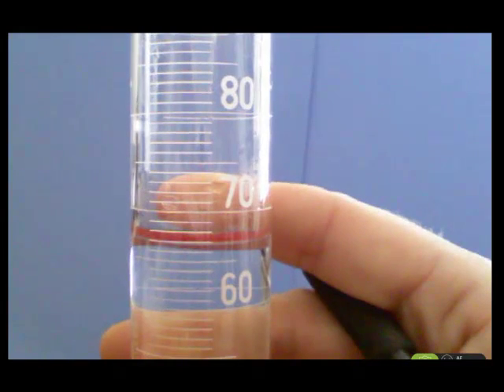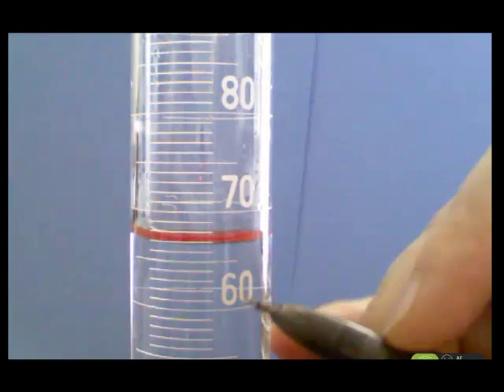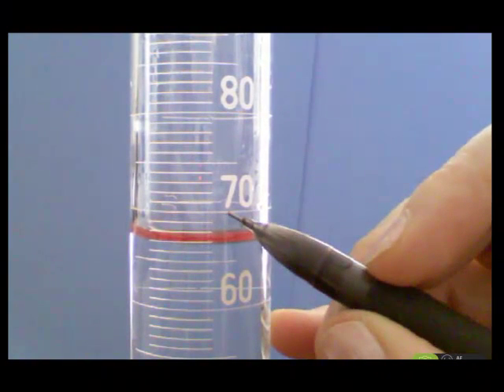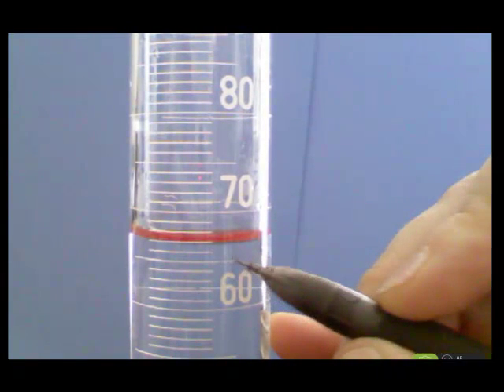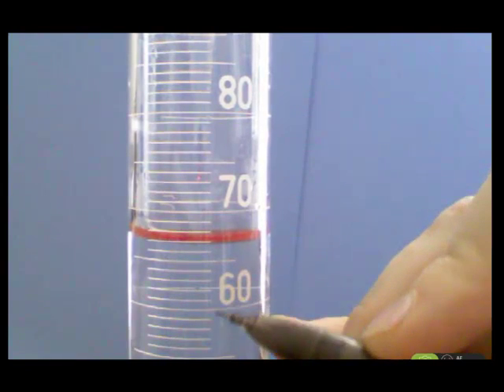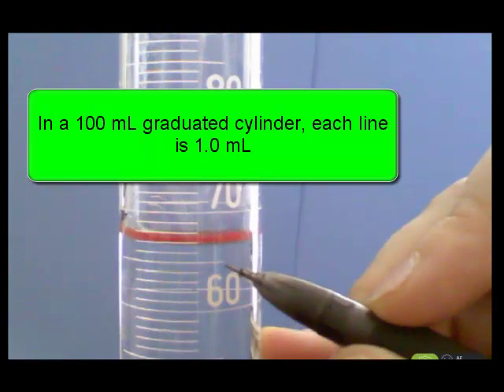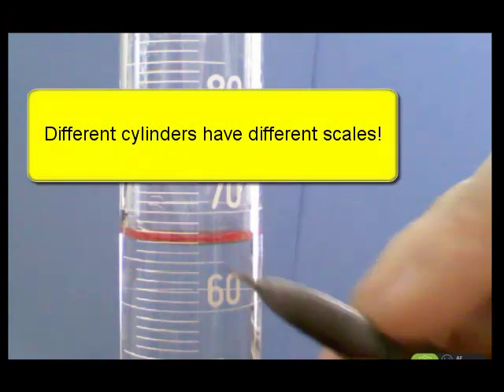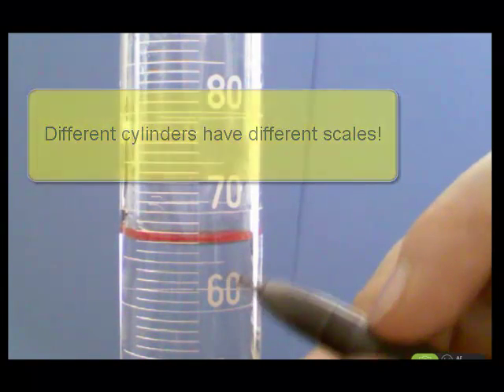Now let's look at the scale. This is a 100 milliliter graduated cylinder. This line here is 60. This line here would be 70 milliliters. So halfway in between, this big line here would be 65 milliliters. So each line is 1 milliliter. Every time you use a graduated cylinder, you need to look at the scale and see how it's divvied up and what each line would mean, so that you can record the correct volume.